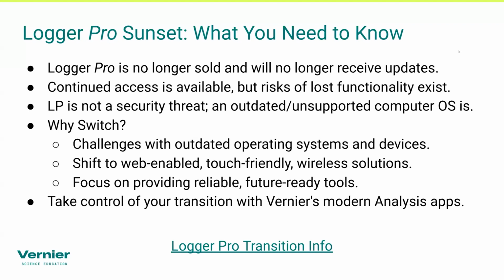Logger Pro is not a security threat. It doesn't talk to the internet at all. It's a self-contained application, but an outdated or unsupported computer operating system is. So if some people take their computers offline and want to keep using them on older operating systems, you're welcome to do that. But at some point, those computers will end up dying or will be taken away. So we want you to start preparing ahead.